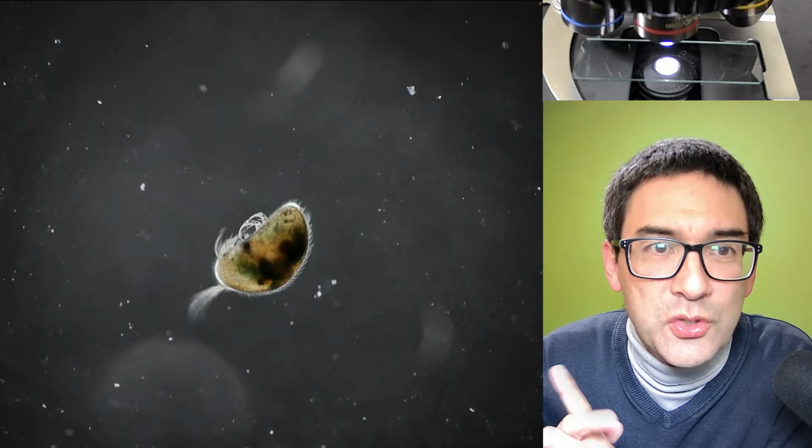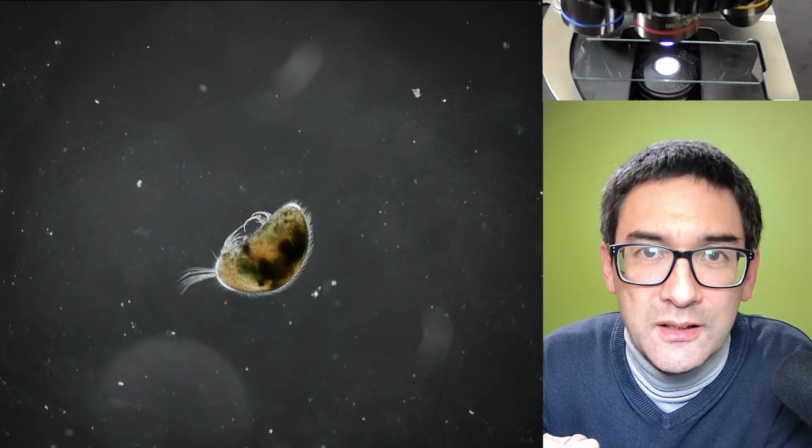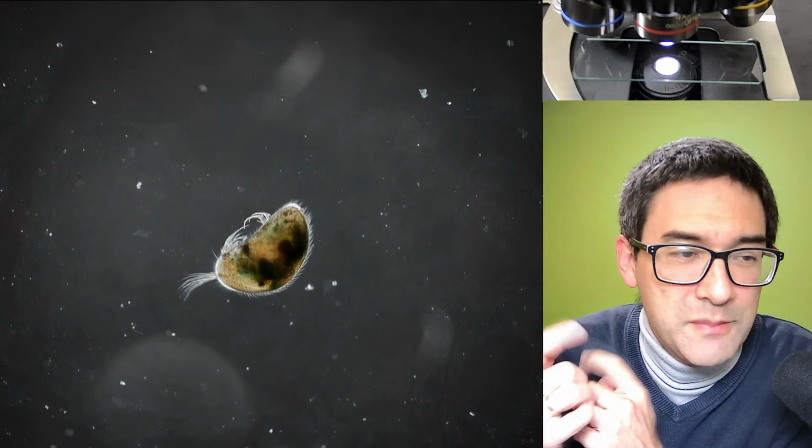For those of you a little bit technically interested, what I actually have is a so-called phase contrast setup, and I also have a DIC. It's a differential interference contrast setup. But for phase contrast, you have a certain filter. And this filter for phase contrast can also be used for dark field. And that's basically what we got here.